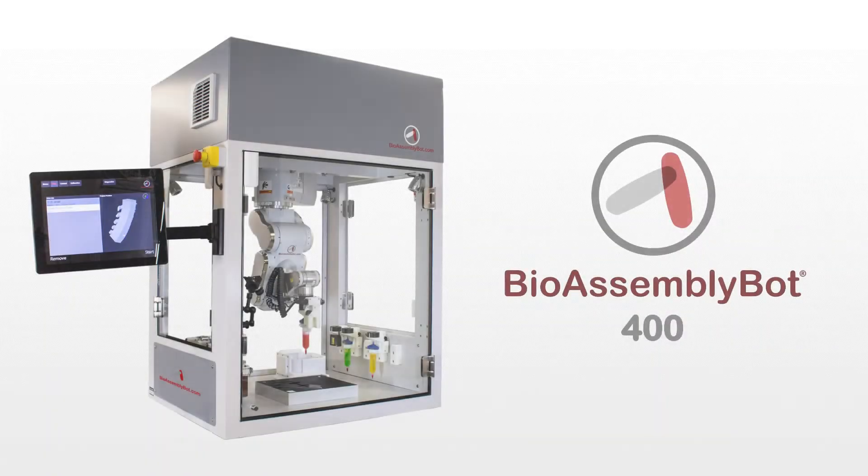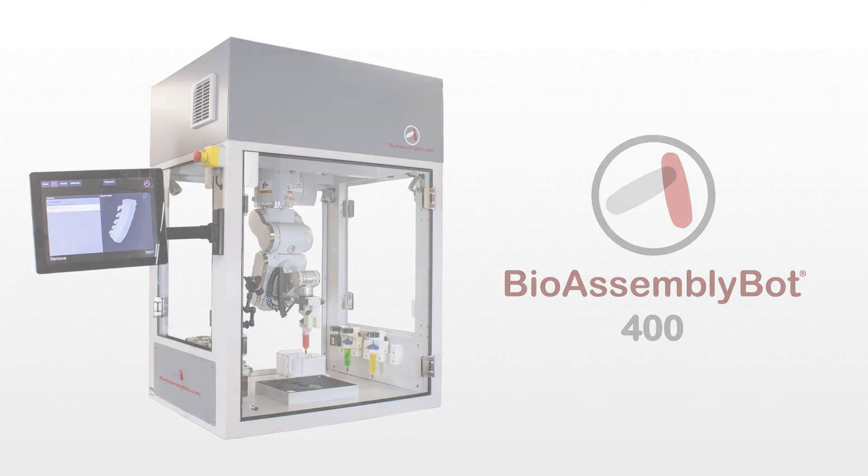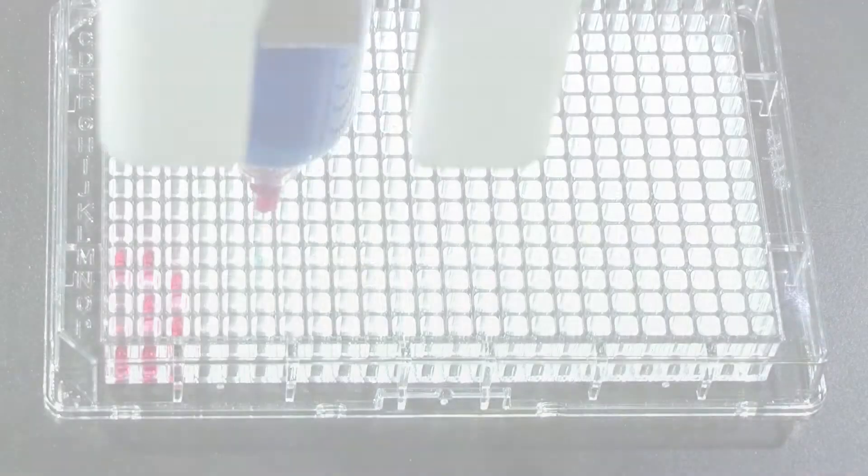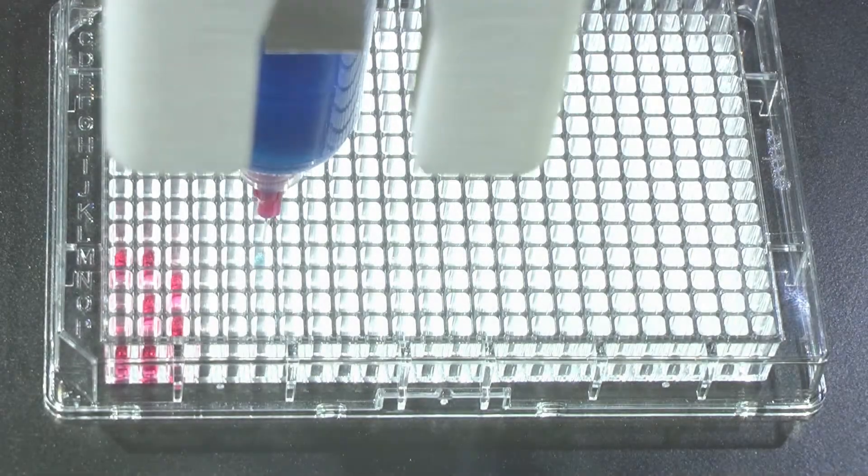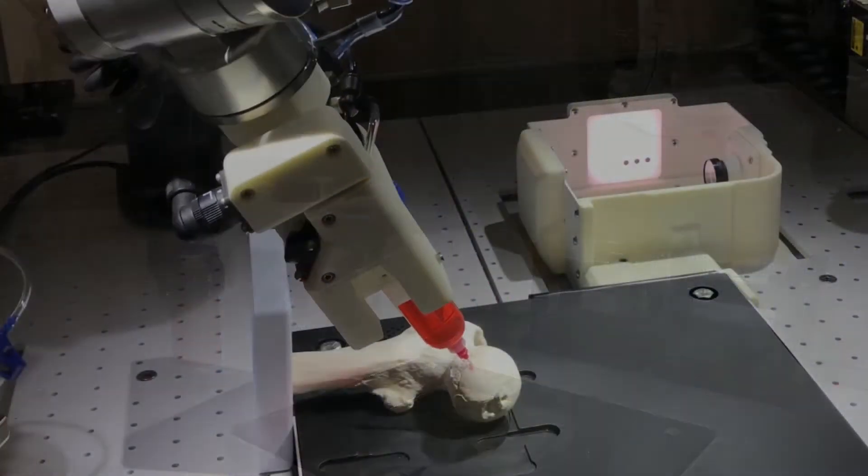Introducing BioAssemblyBot. We call her BAB, an all-in-one platform that enables extraordinary scientific and medical discovery of the human body.